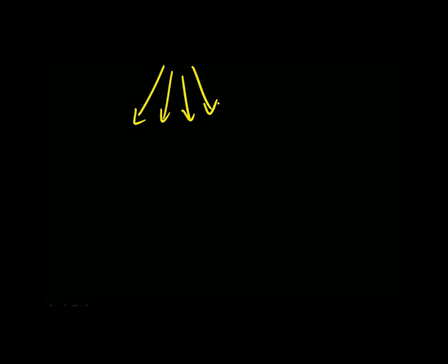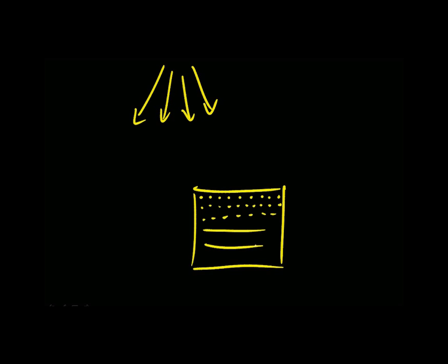It's a little bit difficult to draw both of those planes here. But what that does is, if we looked at our sample in a top view, we can basically make our beam interact with our sample here, here, here, here, so on and so forth, and it will raster across our entire sample.